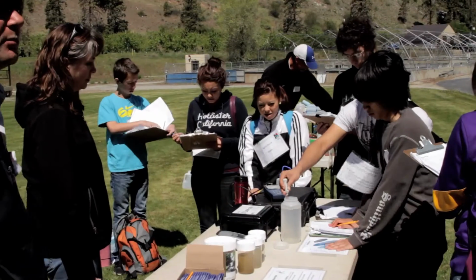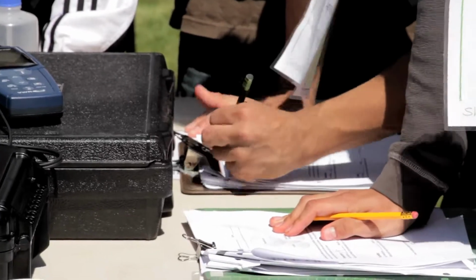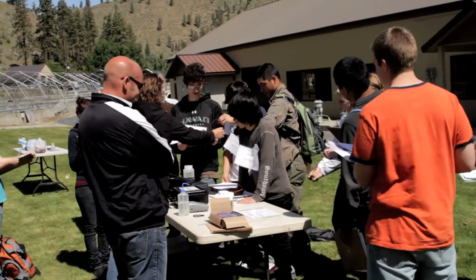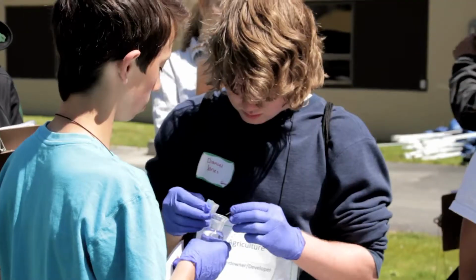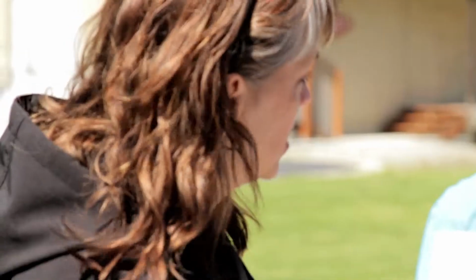Substation 2, Water Quality Testing. Before each test, have the students predict what they think the result will be. Test and record each of the following: temperature, turbidity, pH, and dissolved oxygen. During and after each test, discuss why the test is important, what it measures, and how it helps to determine the quality of the water.